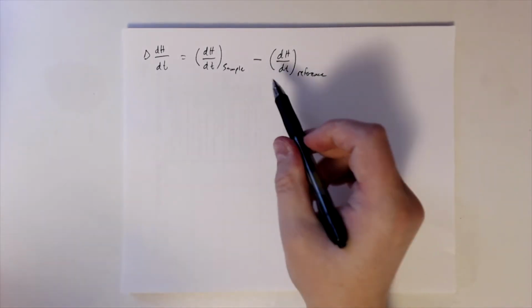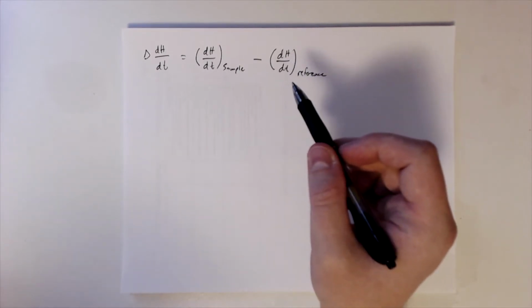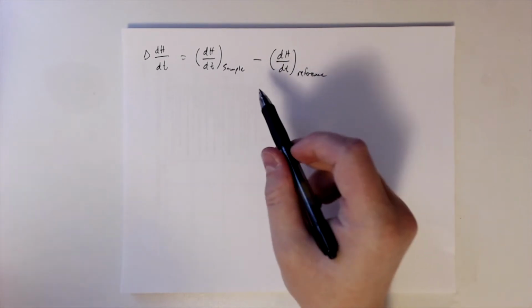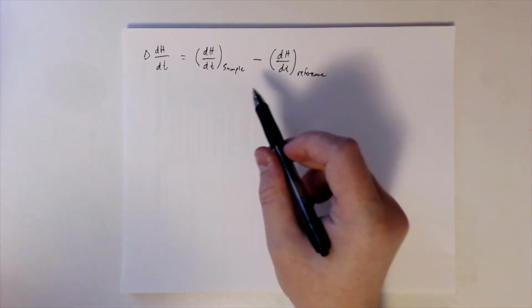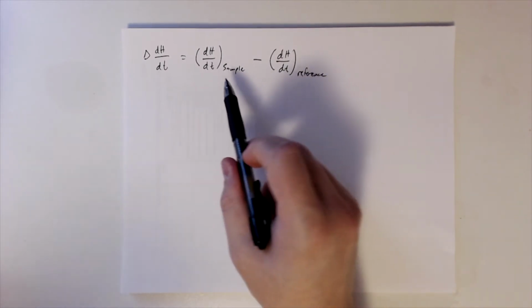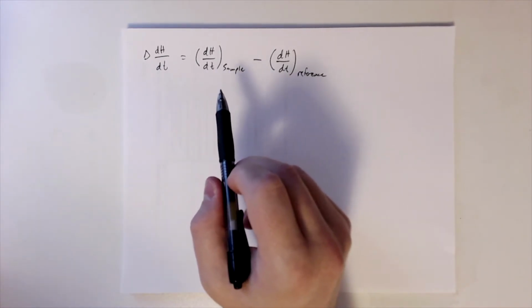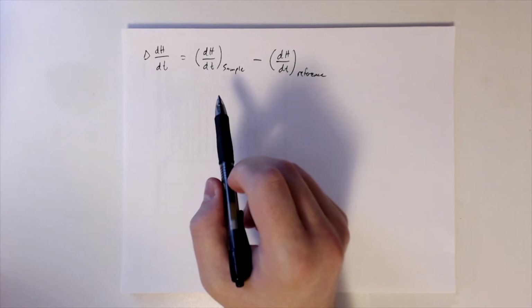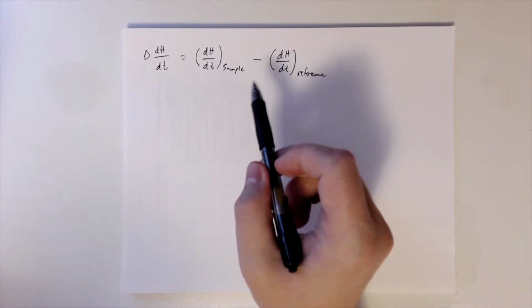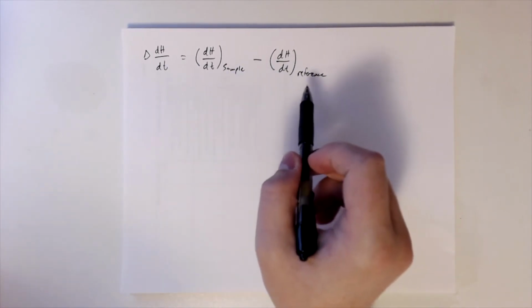So this is just the way we're defining it. And if somebody wrote it different, it wouldn't matter. It doesn't change anything fundamentally. But what it does do is it gives us a convention for the peaks, right? So it tells us if we see peaks, if we're defining it in this way, an endothermic peak should be a certain way and an exothermic peak should be the other way. If you change this, then everything would be opposite, right? Because of the way we're defining sample minus reference.